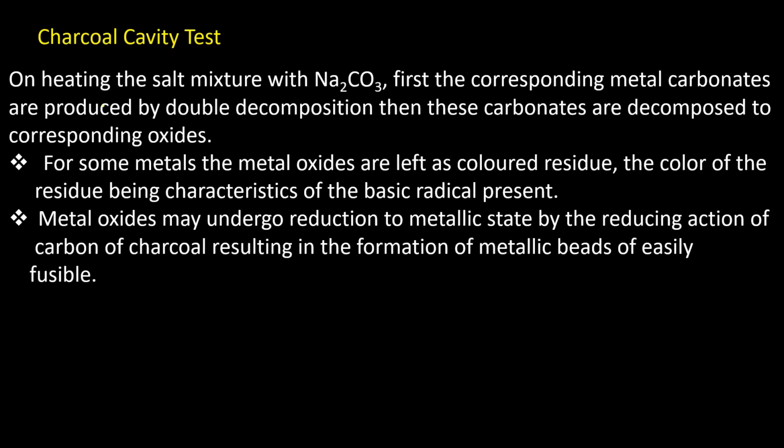See, in the charcoal cavity test, on heating the salt mixture with sodium carbonate, first the corresponding metal carbonates are produced by double decomposition. Then these carbonates are decomposed to the corresponding oxides. For some metals, the metal oxides are left as colored residue, the color of the residue being characteristic of the basic radical present.